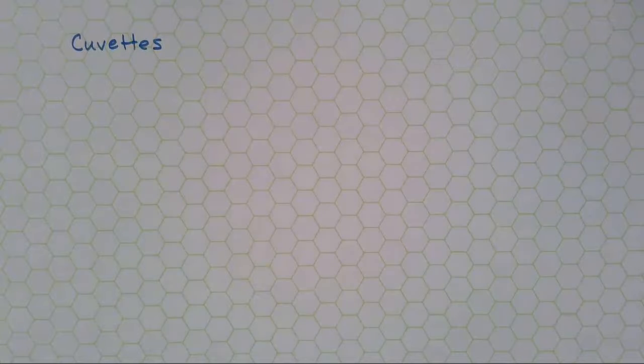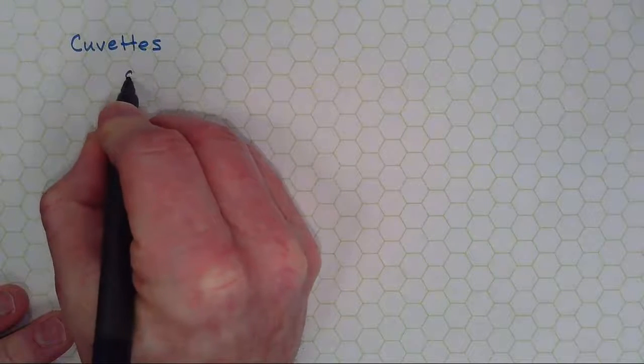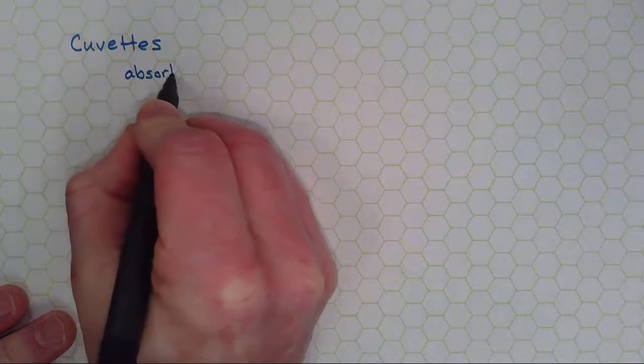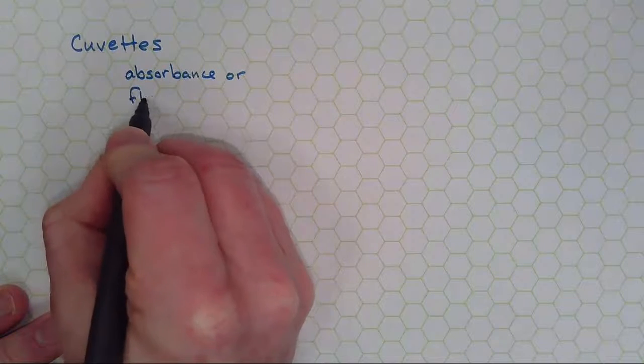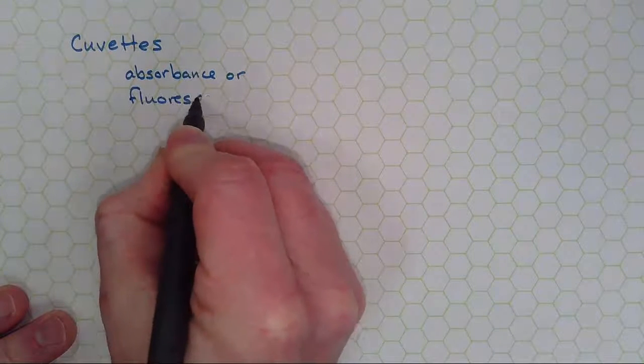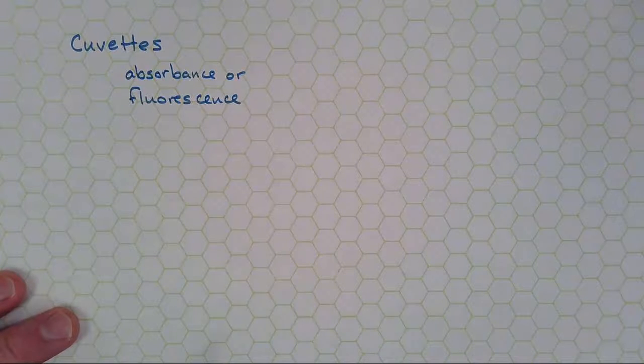Okay, so this video is about how to choose the right cuvette for whatever it is that you're doing spectroscopically. There are a couple of things to think about. The first is, are you doing absorbance or fluorescence?